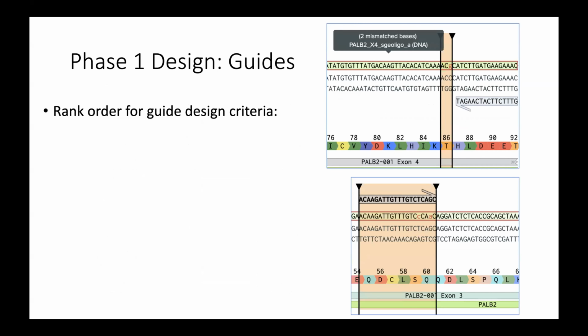And so here I'm going to start now talking about the design of the HAP1 cell line and the gene choices into the actual reagents. So starting with the guide RNAs. So our priority ranking is with 4 points here.